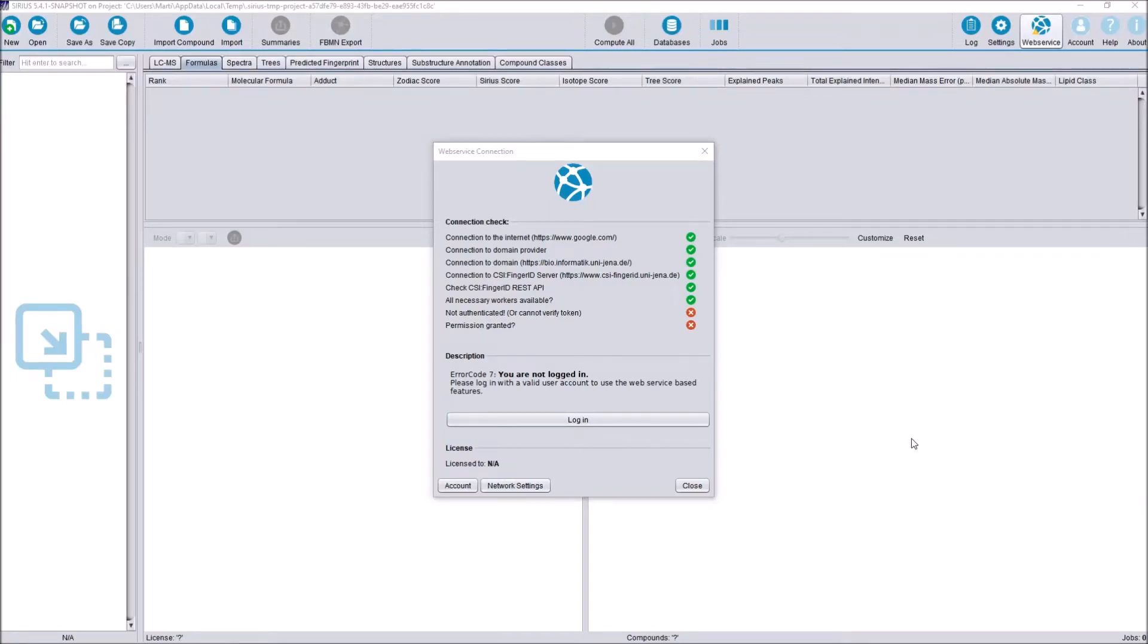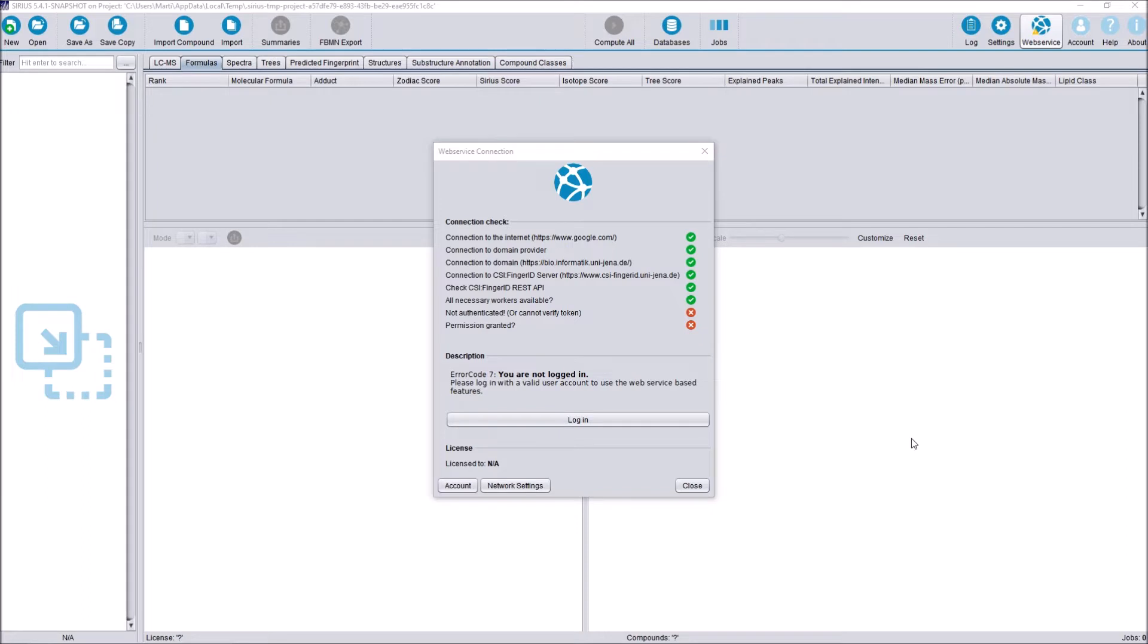Hello everyone, my name is Martin from the Chair of Bioinformatics of the Friedrich Schiller University in Jena and today we proudly present SIRIUS 5, the major version upgrade of SIRIUS. In this video, I'm going to introduce you to added functionalities, major version changes, UI changes and more.